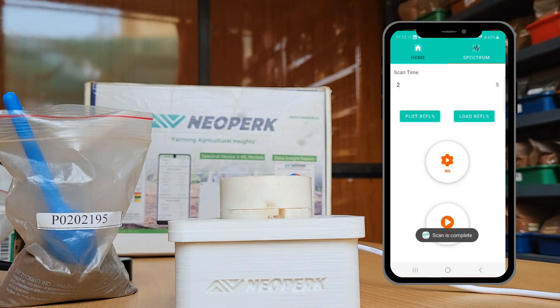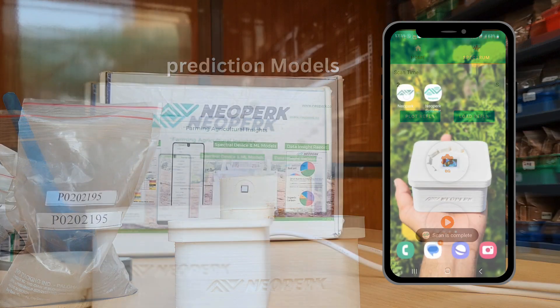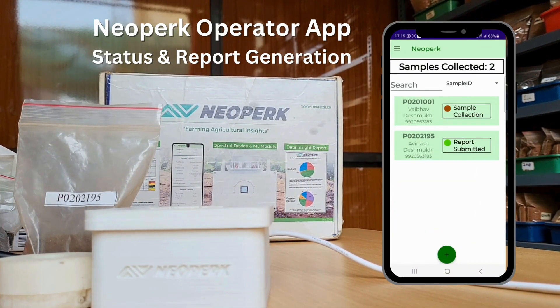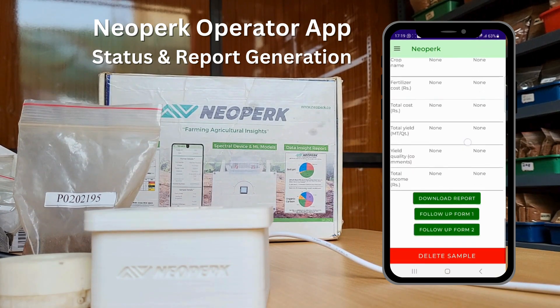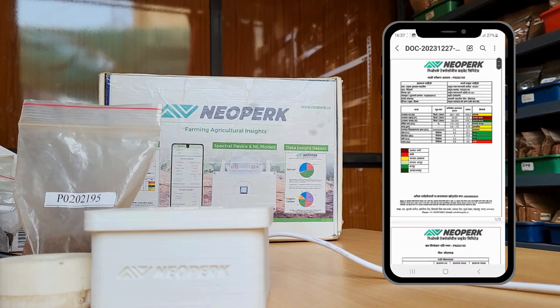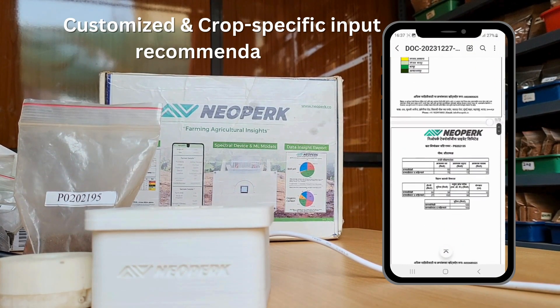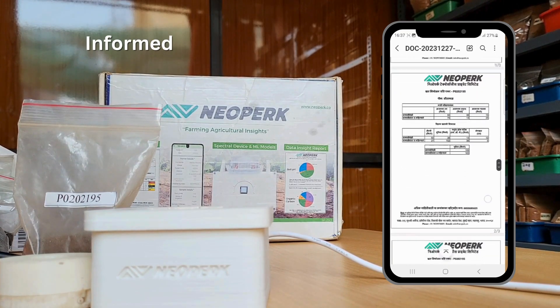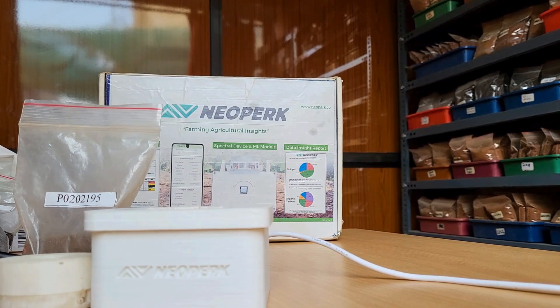Once the sample scans are completed, a cloud-based machine learning model will generate the results and update the status in the Neopark Operator app. The generated soil test report provides customized and crop-specific input recommendations, which helps the farmer take informed actions to optimize soil fertility and improve crop growth.